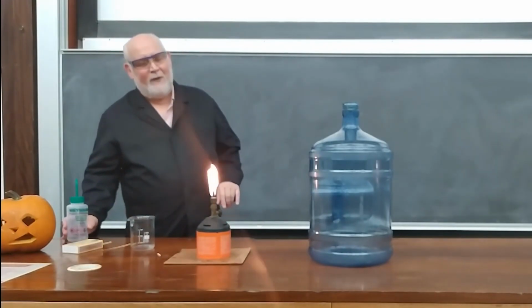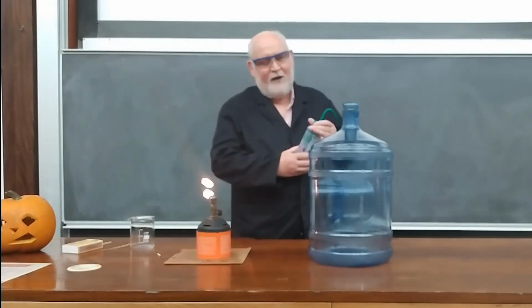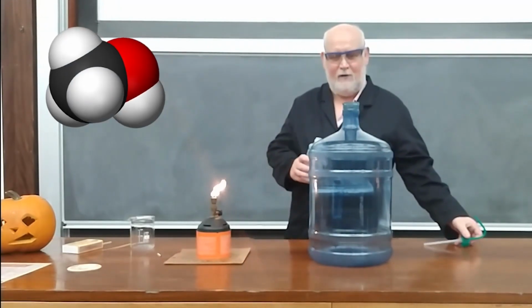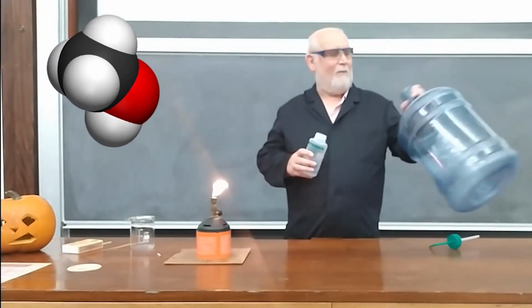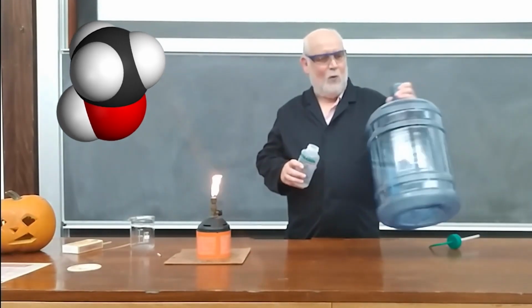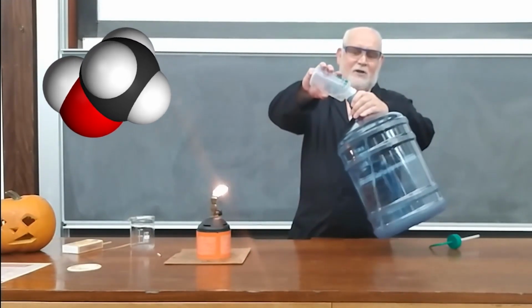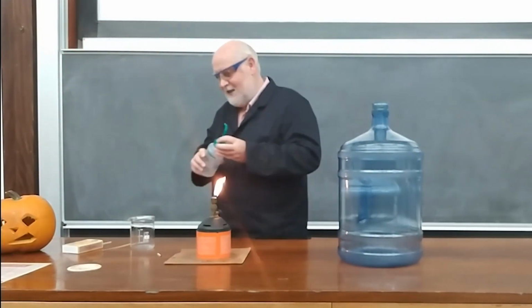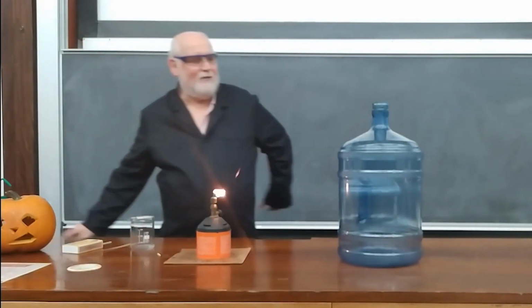Let's have a look at some complete combustion. So what I've got here is the fuel for drag racing cars. This is the alcohol methanol, CH3OH, and we've got a 20-litre water canister. Let's use the fuel as methanol and the canister as our reaction vessel.